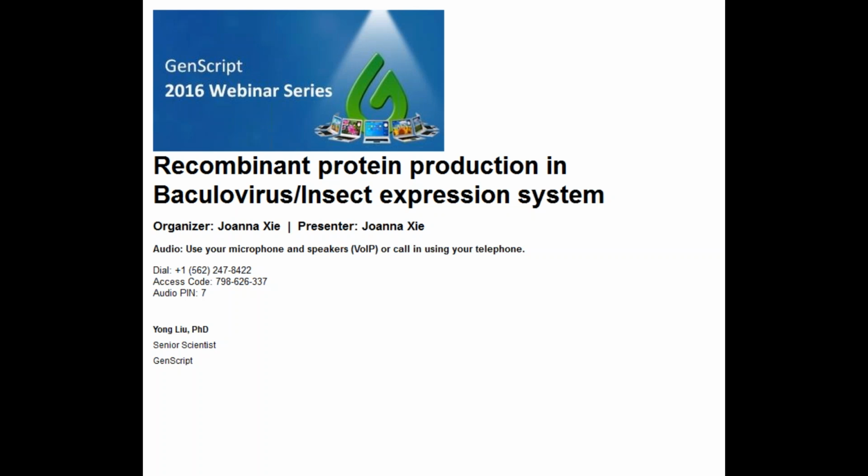Now this slide lists the number of entries in the protein data bank by expression system as a percentage of the total number of chains within identifiable expression system. Now data here shows that E. coli is the top choice for protein expression in general, and insect is the top choice in eukaryotic expression system.